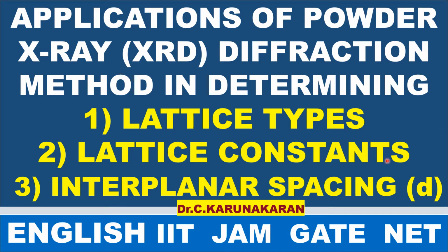Two, lattice constants, the unit cell length a, for a cubic unit cell a equal to b equal to c. Lattice constants, unit cell lengths, are determined. Three, interplanar spacing can be obtained from powder XRD.